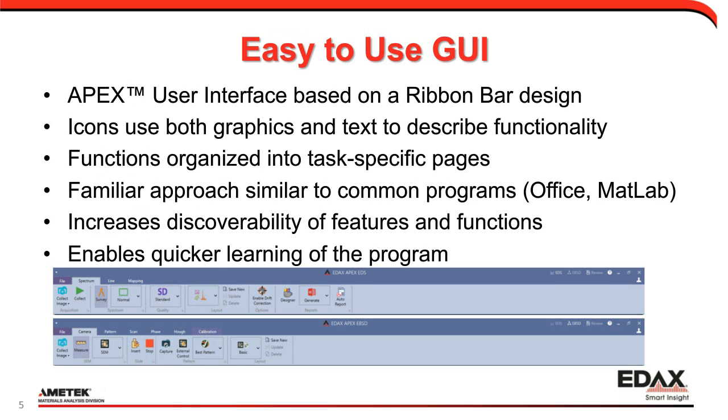So the first thing I want to introduce is the user interface. It's of course the first thing you see when you use the application. And so really we've tried to design it to be easy to use, and we've built it off of a ribbon bar type of approach. This is similar to what you'd see in Microsoft Office type applications or MATLAB. It's a pretty common user interface paradigm.